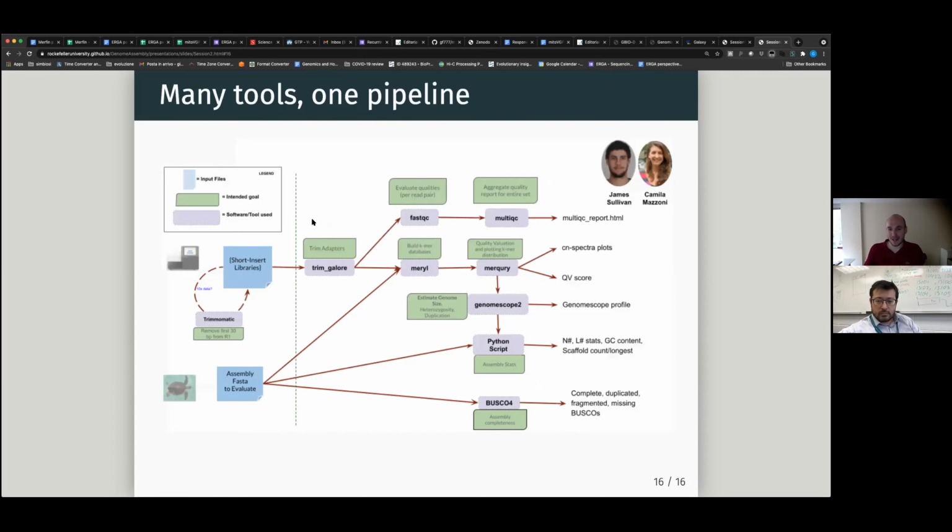This is it. I will finish with this slide. It's something we had planned but in the end did not implement: instead of using Galaxy, running this exercise on the HPC cluster of the Rockefeller. Of course, it's much more complicated to install.